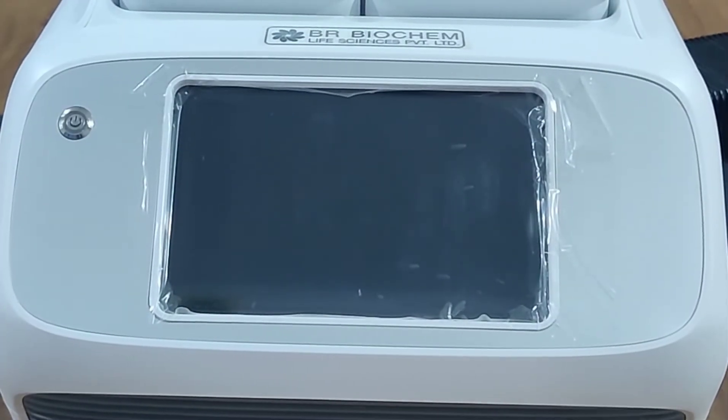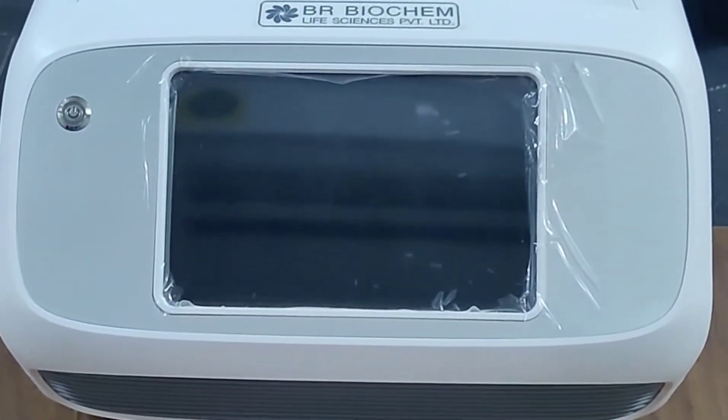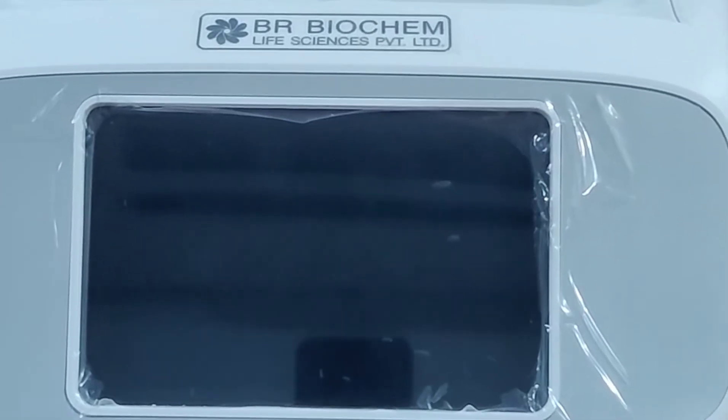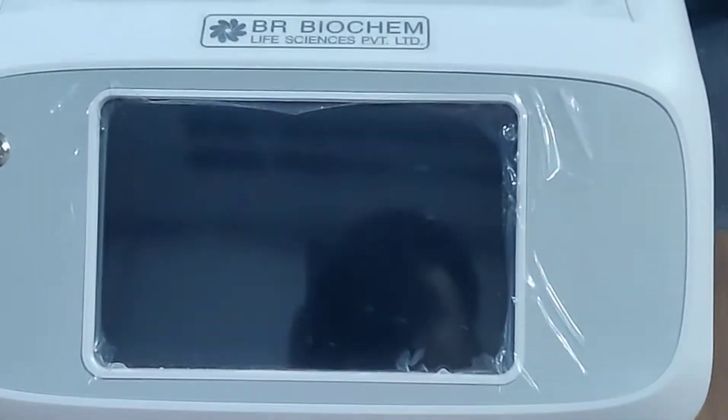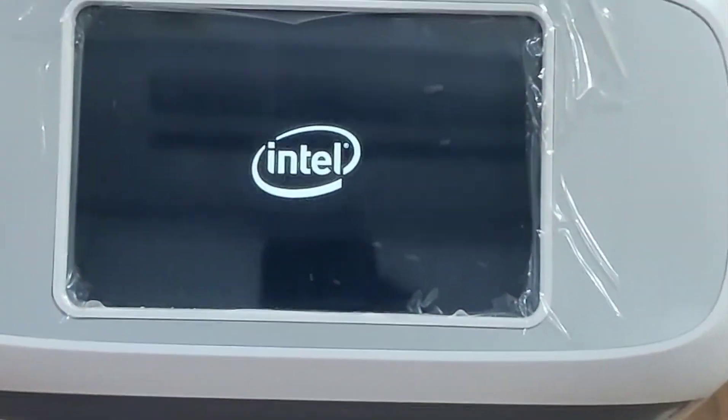Welcome to BR Biochem Life Sciences Private Limited. Today we discuss the RT-PCR machine. As you can see in this video, this is our RT-PCR machine of 16 wells. By pressing this key, you can start your RT-PCR machine.